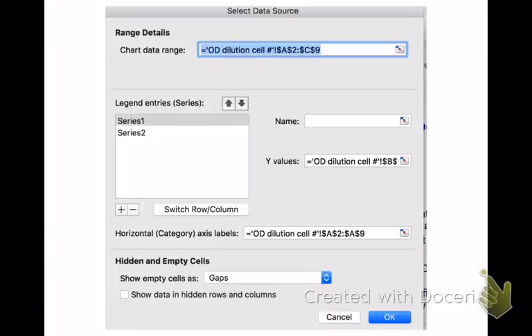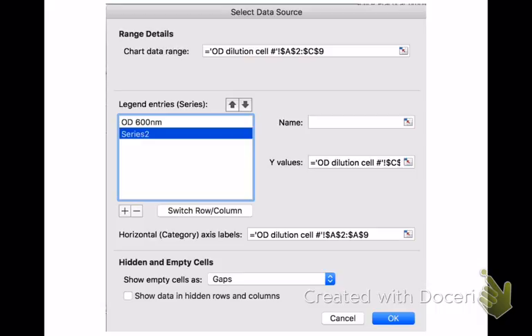Now we want to go back and add some proper labels. So again, you can select the data source by clicking in your graph and doing a command or a control right click. And you will get this selecting data source screen again. And now we're going to highlight series 1. And over in this box, which is currently empty, we're going to type the name that we want to be associated with the legend for series 1. Because series 1 is not meaningful to anyone. You need to tell them what they're looking at. And then we're going to type that in and hit OK. I labeled series 1 OD 600 nanometers. And now we're going to do the same thing for series 2. We simply select series 2 and type the name in and hit OK.